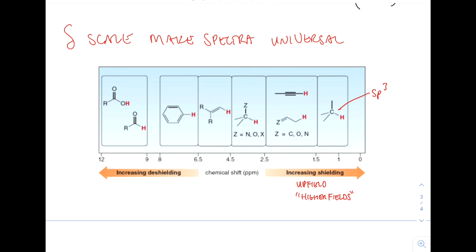And so you can see that, well, we've got our heteroatoms here, and then I think I said even lower field. Sorry, the alkenes and the heteroatoms, even though they're explicitly drawn side by side on here, can switch back and forth. So it just depends again on the magnetic environment of the organic species that you're discussing or observing. But this is a nice generic outline of what we would expect, right?